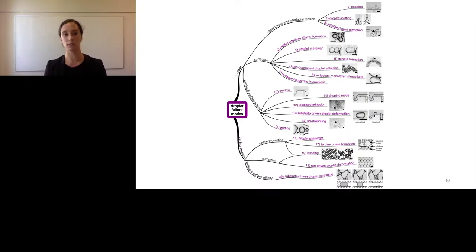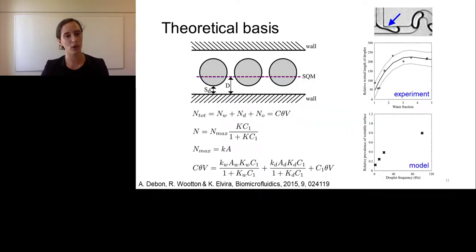So we're not going to go into this in too much detail, but I am going to bring up one droplet failure mode. The math is not so complicated here, but I'm also not going to go into much detail because I don't have time at the moment. But what we were looking at here is that surfactant molecule, that stabilizer molecule in our droplet microfluidic system.